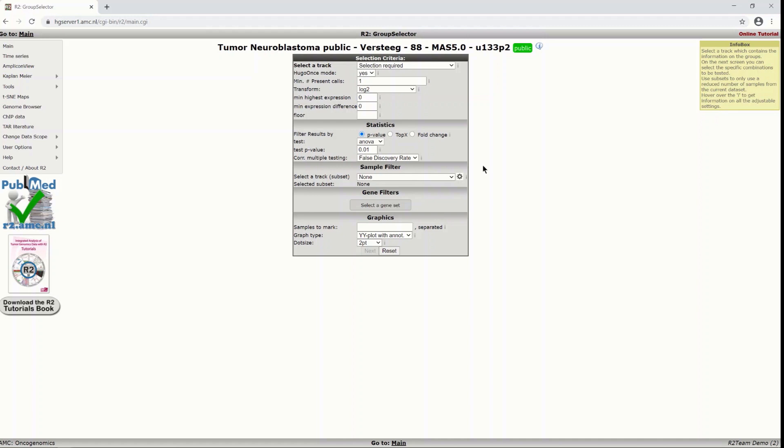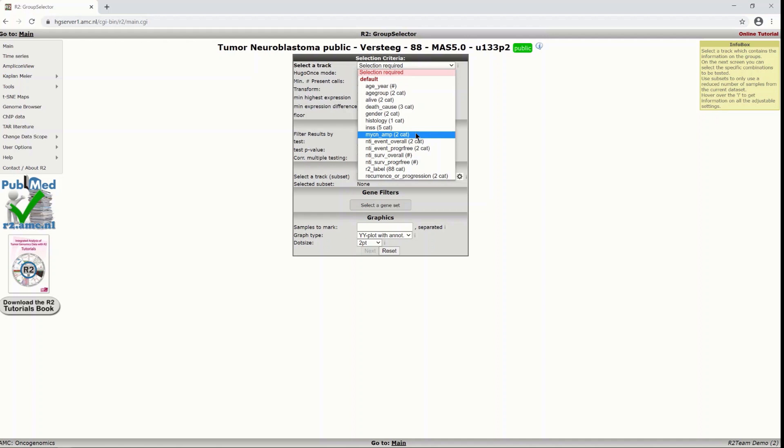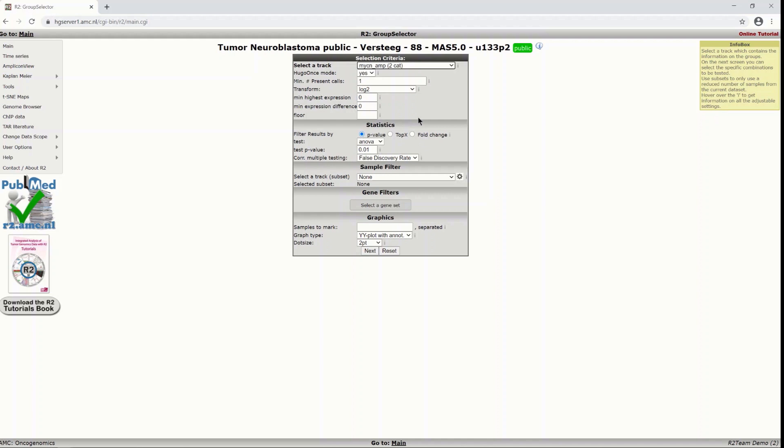So you get this menu in between where you at least have to select a track on which the division will be based between which groups you are going to have a look. In our case, let's have a look at the MYCN amplification. So we get one group that has a MYCN amplification another group that doesn't have this amplification and we are going to see which genes are differentially expressed between these groups.